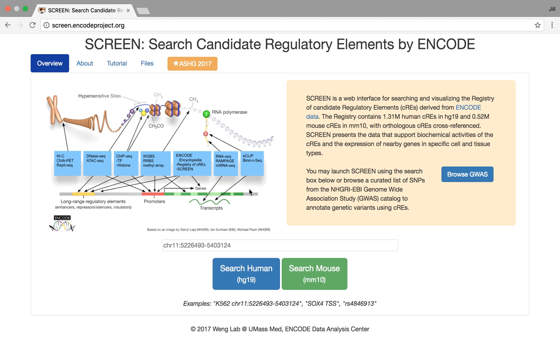This is where we're trying to integrate all the candidate regulatory elements, all of the information we have about these from other ENCODE datasets, as well as some other external resources. To combine them all into one place, kind of a one-stop shopping. This is the home screen.